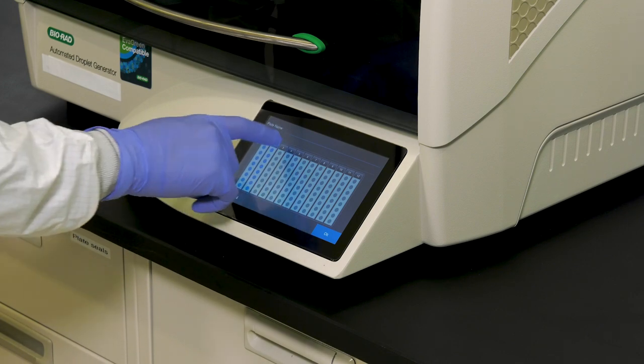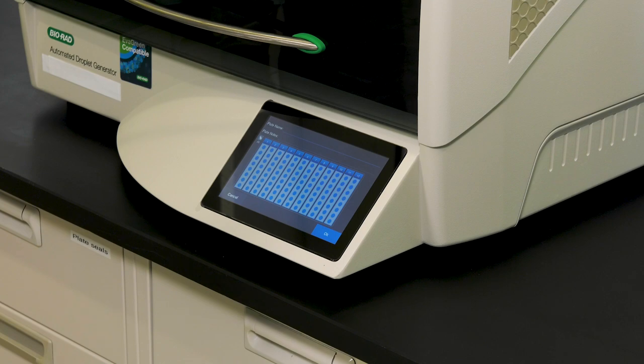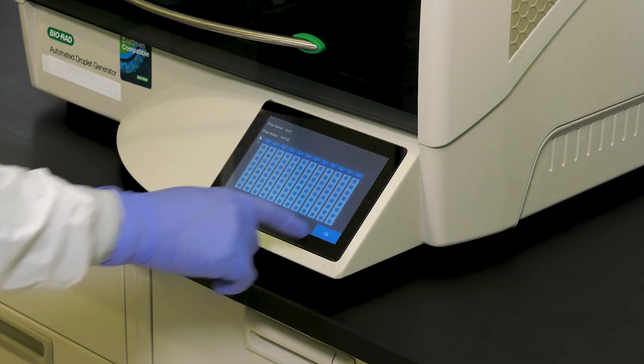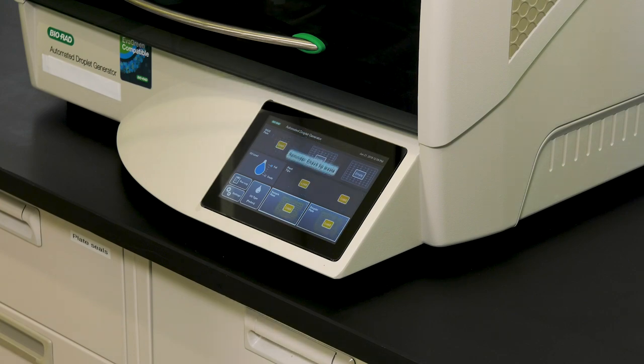Create a plate map by touching the Configure Sample Plate button. On the plate map, select the columns from which you wish to generate droplets or press the blue arrow to select all the columns for a complete 96-well sample plate. You can name the plate map and add notes if you desire. Press the blue OK button to return to the main screen.